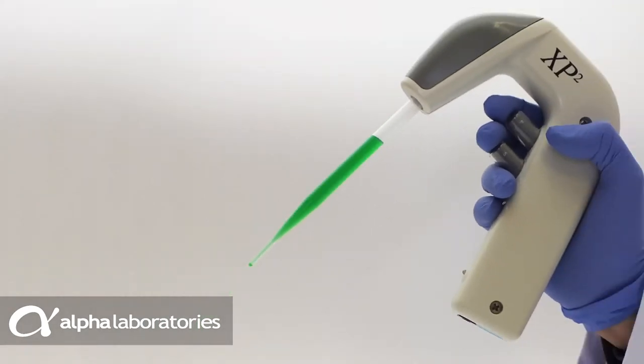Aspirator pastettes are the best choice for delicate and valuable cell lines and a must-have for work with infectious and hazardous materials.